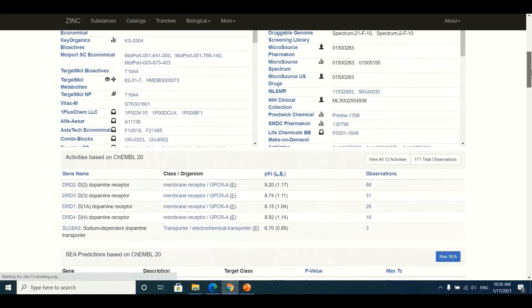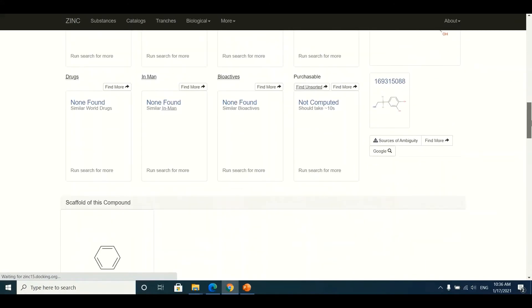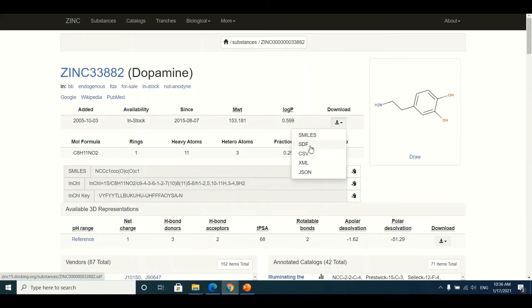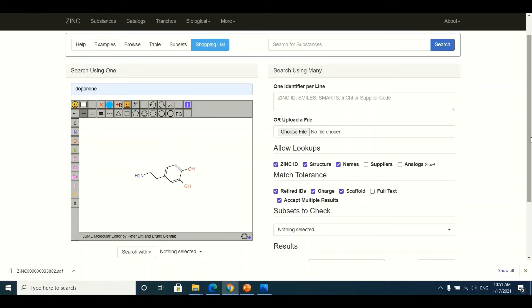The dopamine structure available in the ZINC database will appear, along with a lot of associated information. To download the three-dimensional structure of dopamine, I click on the entry and then click on the SDF file option. The three-dimensional structure will then be downloaded to my system.